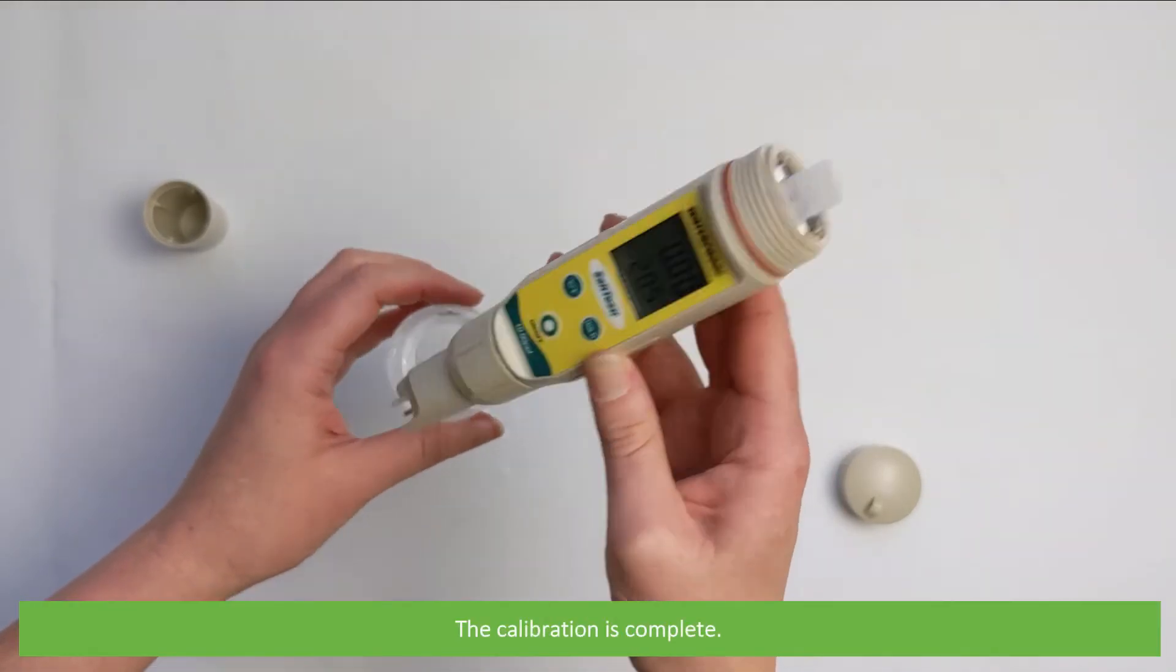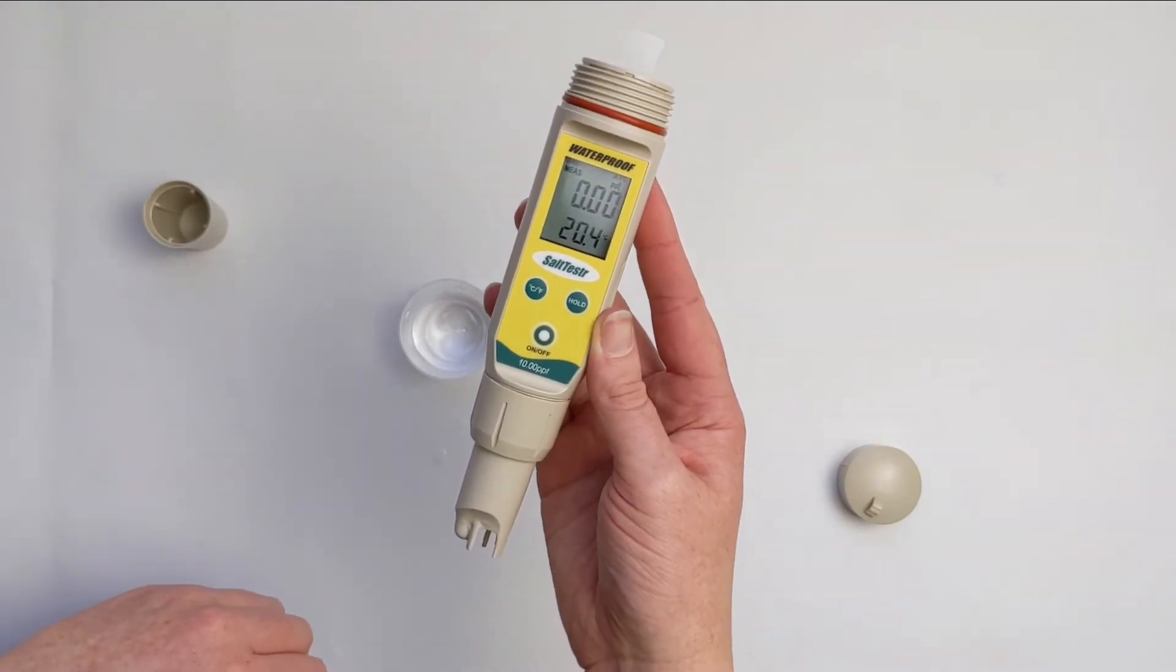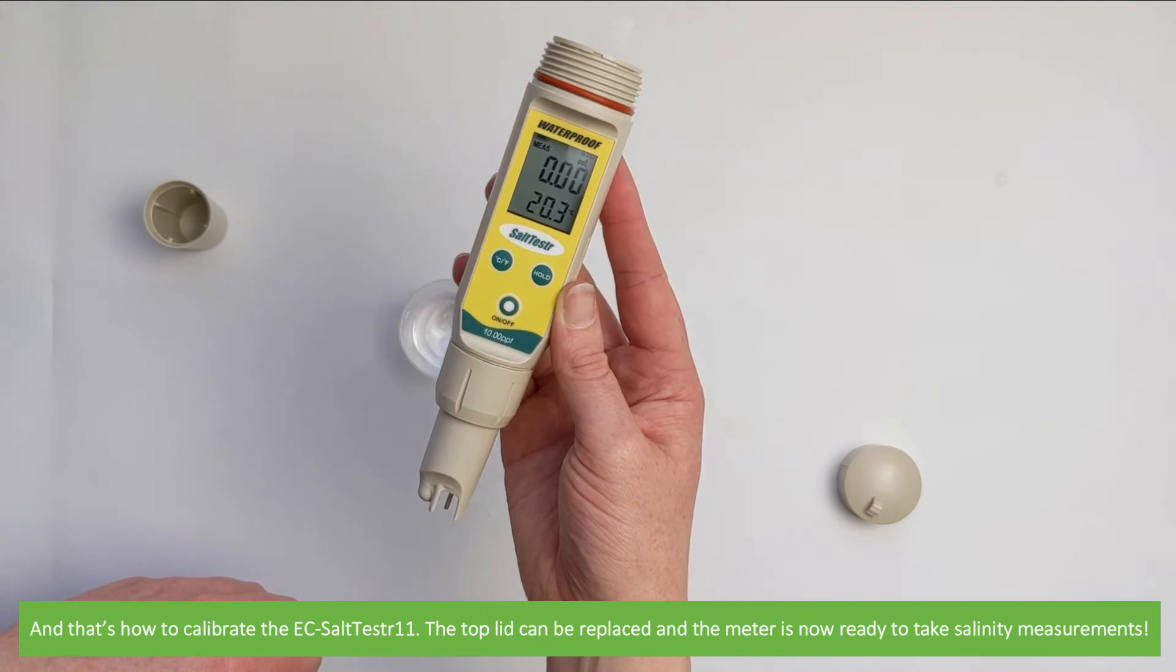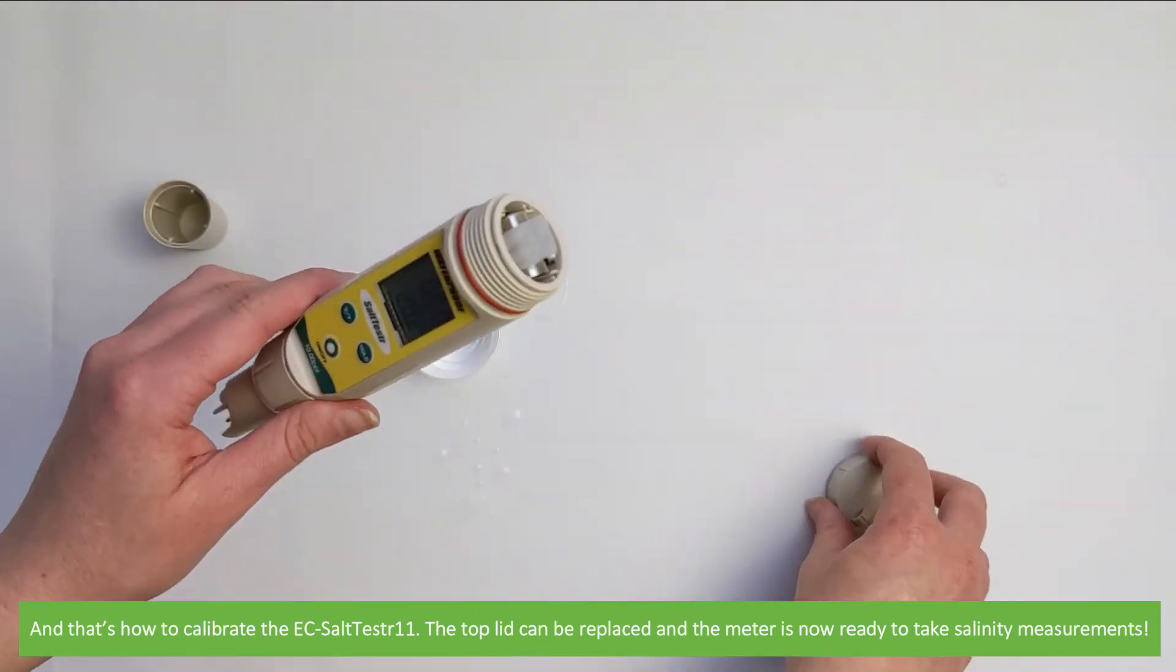The calibration is complete. And that's how to calibrate the EC Salt Tester 11. The top lid can now be replaced and the meter is ready to take salinity measurements.